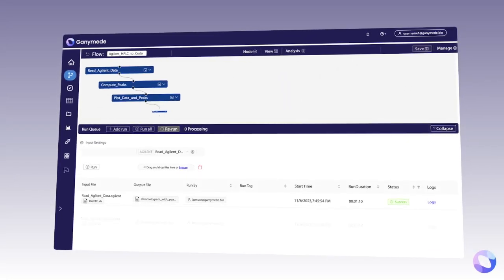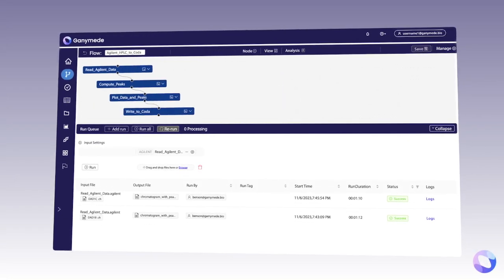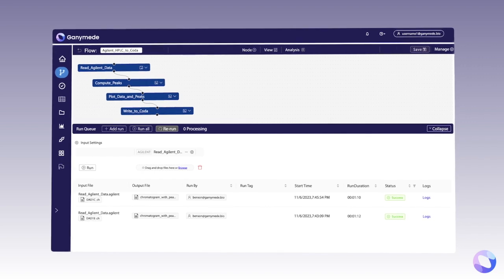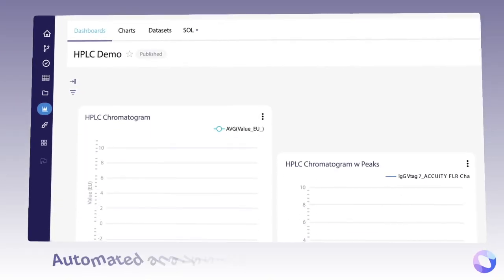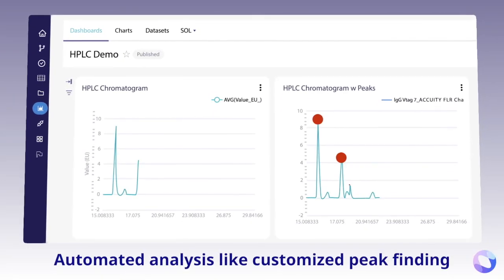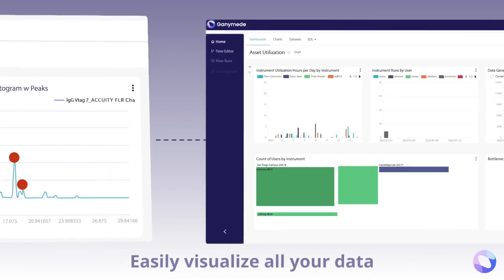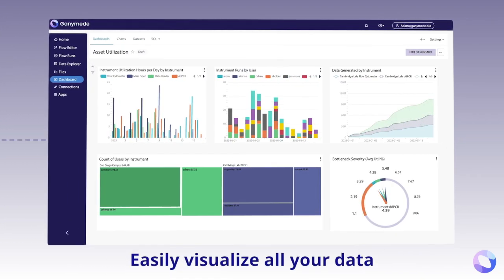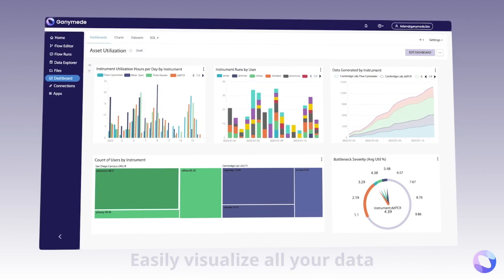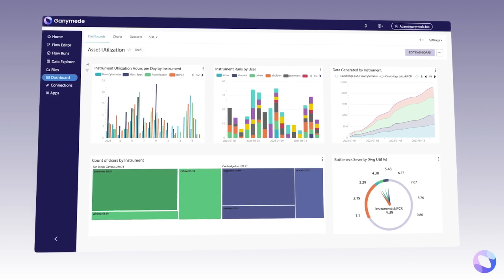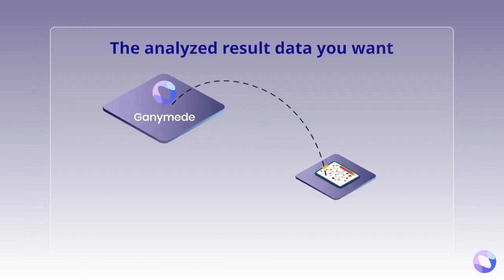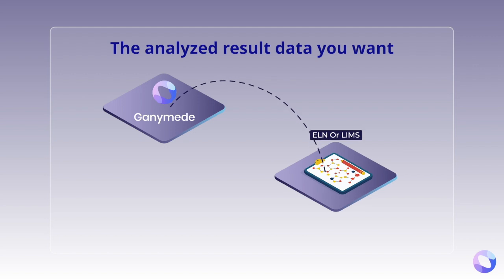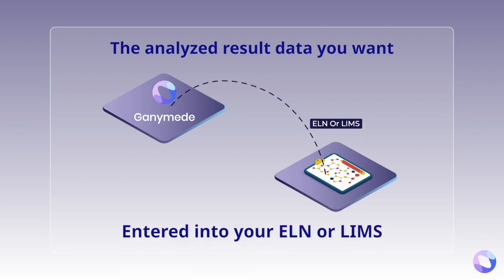This data is then automatically parsed into a standardized tabular database format. Ganymede can run automated analysis, like customized peak finding, and can easily visualize all of your data or compare runs using rich visualization tools. Finally, the analyzed result data you want is then automatically entered into your ELN or LIMS.